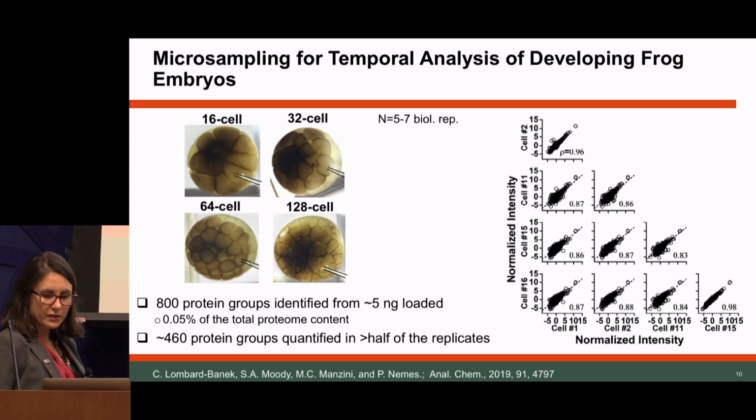And although we had some comments about correlation before, the reason I'm showing those correlations here is that I collected some of the data a year apart. I want to demonstrate two things: first, that the sampling method is extremely reproducible, even years apart, and two, that if you operate capillary electrophoresis with a very good standard operating procedure, it is very reproducible. And this is what is shown here with those high correlation coefficients for different 16-cell embryos measured across a year-long span.